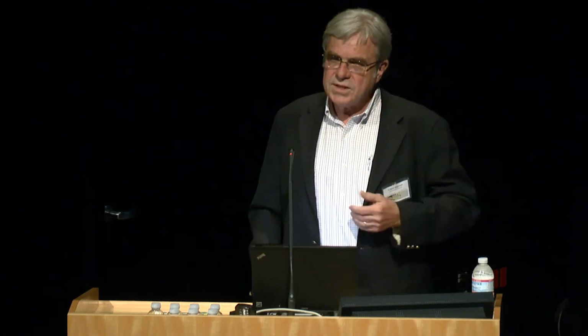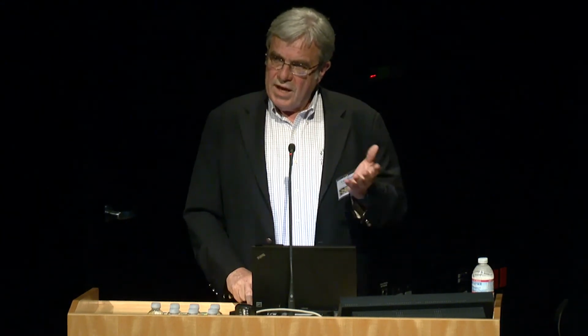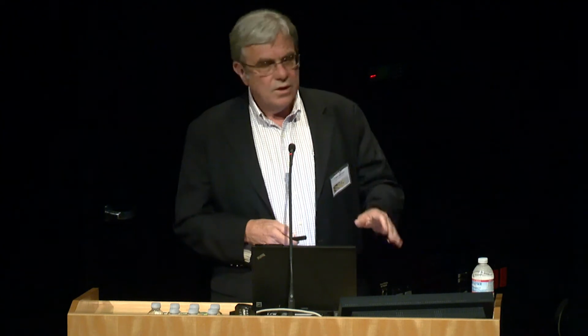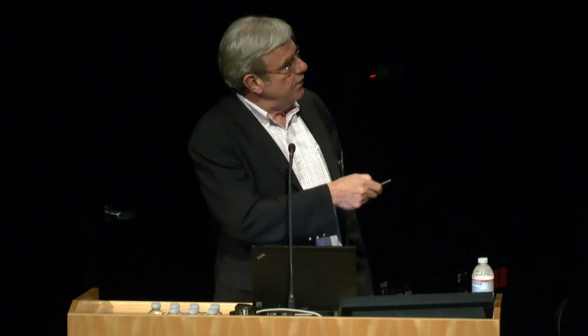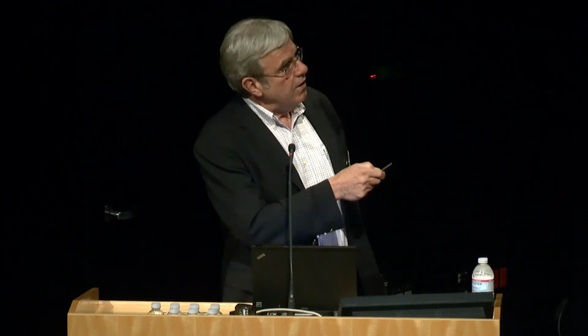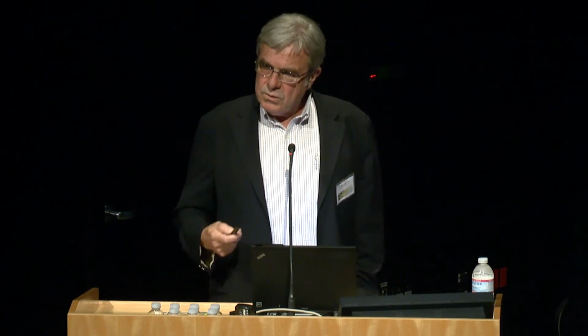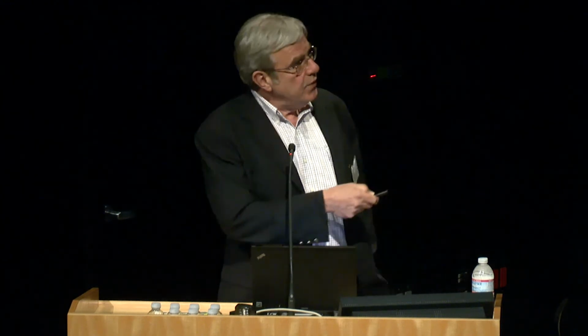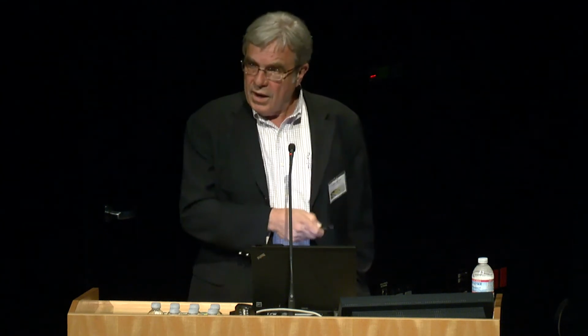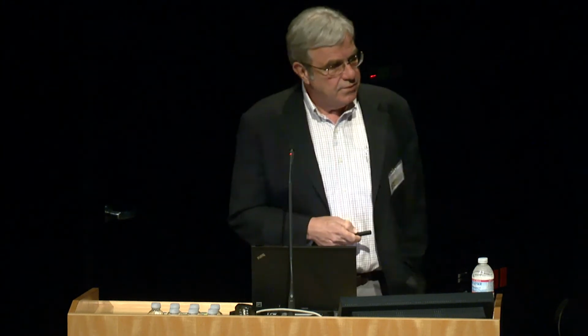So we wondered if we could use this ionophoretic technique to look at something I showed you earlier, norepinephrine, and how norepinephrine may be affecting neurons. So these are some measurements in a different region of the brain, a region called the bed nucleus of the stria terminalis. Here's what the background looks like, absolute flat line where oxygen is. We can put into these barrels a marker, an electroactive marker, something that has no neurochemical effect, but which we can use to see when substances are ejected from the barrel. So this is the ejection of 4-methylcatechol, our electroactive marker, just to let us know the barrel's working well, and there's no change at all in the oxygen signal.